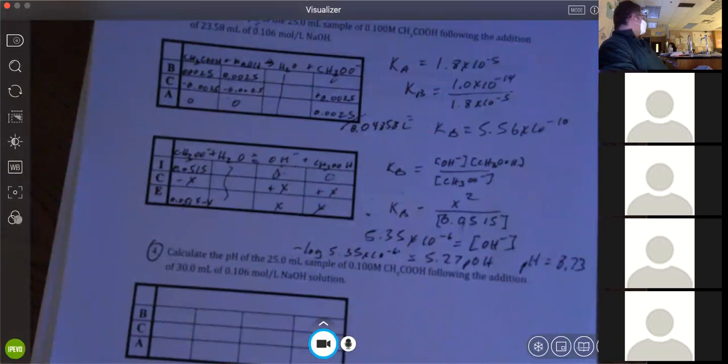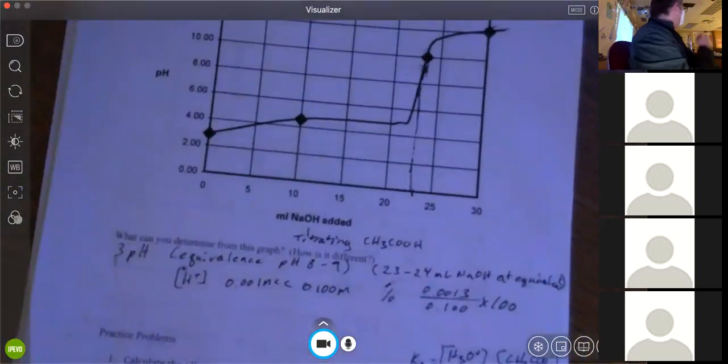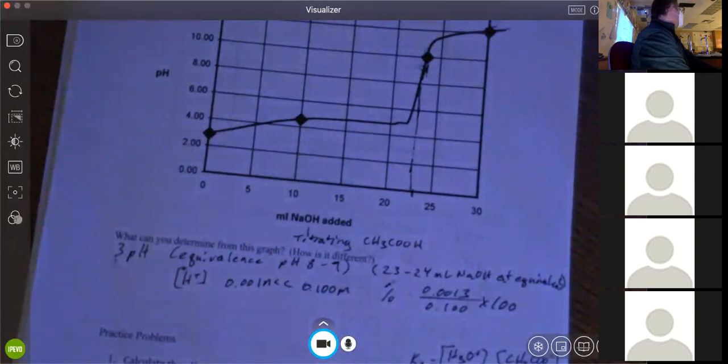That's why we used phenolphthalein last time, because it actually changes between pH 8 and 9. So if you were doing a strong acid, strong base, you wouldn't want to use phenolphthalein because you would have more base added to get that color change. You would want something that changes right around 7. Now, going to that point, those indicators change right at the pH equal to their pKa.